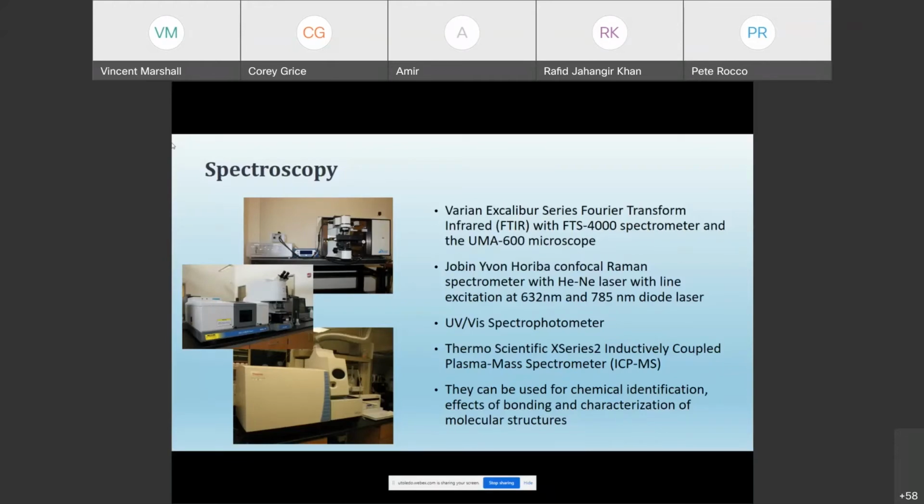With the ICP-MS, it is best used for trace level analysis. Let's say you've got a metal that has trace levels of different elements in it that are there intentionally or unintentionally, and you want to analyze that. You can use this instrument to perform that characterization and understand some of the finer contents. Also, if you've got a bulk material and you want the most representative composition for that entire material, this has the advantage that you can take the entire sample, digest it, dilute it, and get an accurate concentration that way. Whereas the EDS technique is only going to show you locally wherever you were viewing with the electron beam itself, so it may or may not be representative of the true bulk sample.